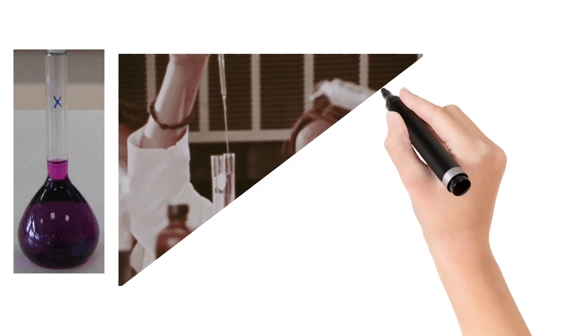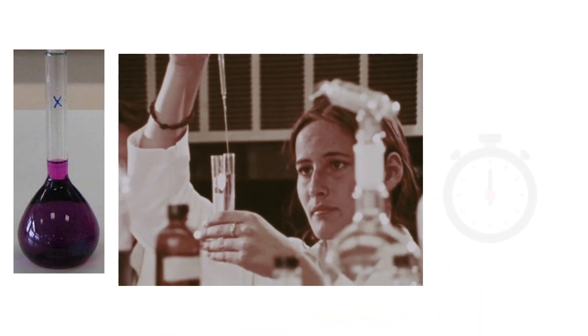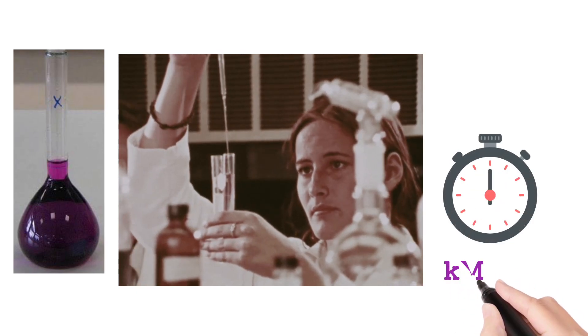Add to it 8 ml of 0.01N KMnO4 solution as the temperature of spirit reaches 15 degrees Celsius. Stir it gently and immediately note the time of addition of KMnO4 solution.